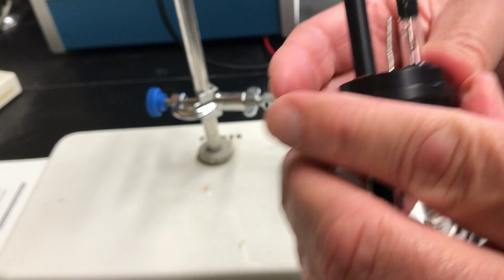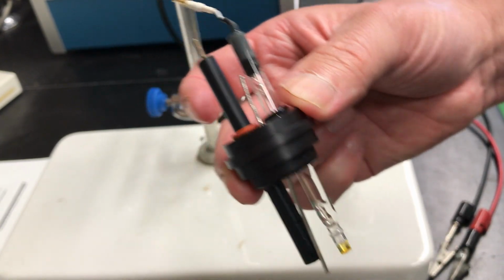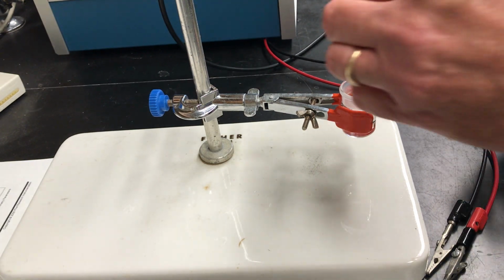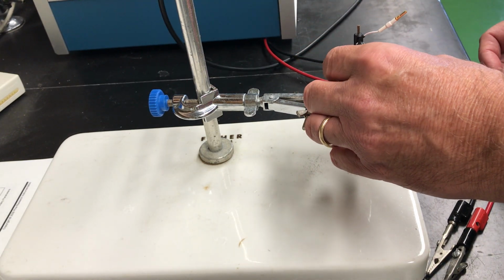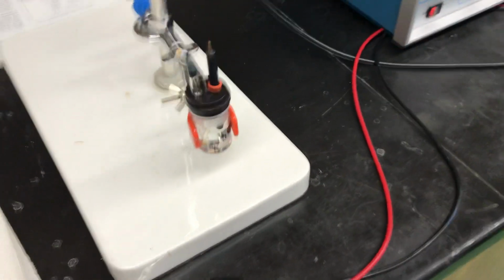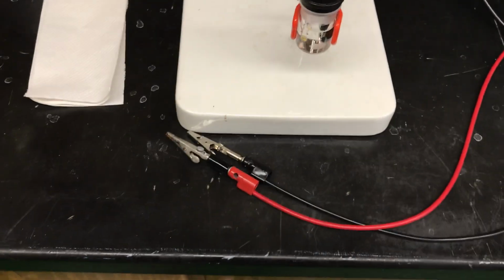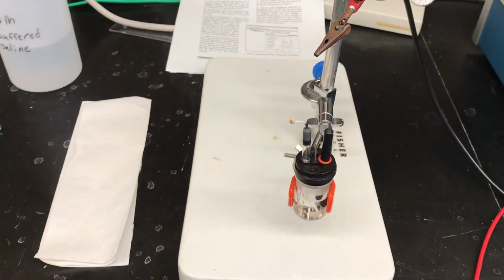And what I end up with is an assembly that looks something like this. Okay, that whole assembly will be dipped into the cell container. And as I mentioned before, the cell container is filled to about 2/3 or halfway point with the buffer solution here. Okay, so now you can come in here and see that.